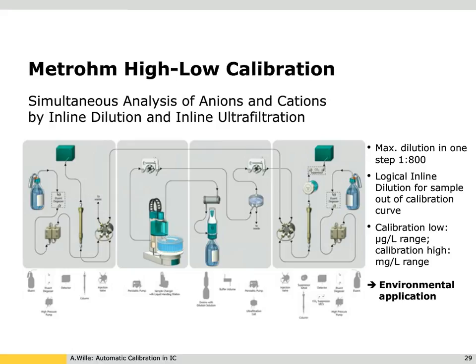The calibration for the low range is done here in the microgram per liter range, for high in the milligram per liter range. An application which is running for environmental samples, so here surface water, river water, wastewater samples. And I would like to show you also some results here from a system stability test.